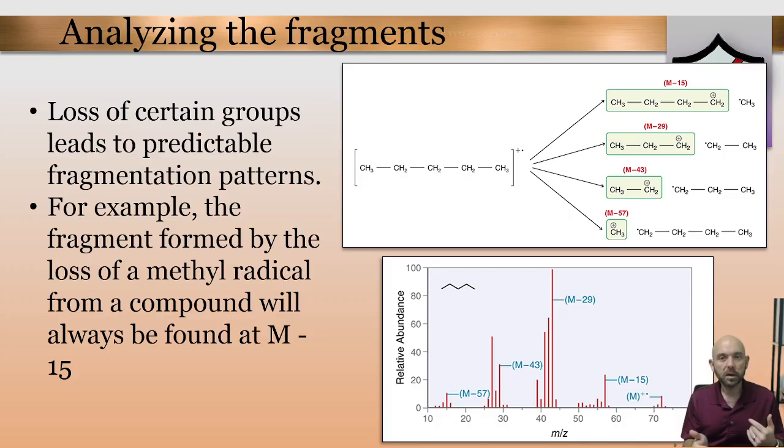So we can gain some information there with some analysis we can do on the so-called fragment peaks that we see down further closer to the front of the spectrum. And we see predictable patterns of these peaks across the mass spectra of different molecules. These fragments come from the fact that once these bonds have been compromised by having an electron knocked out of them, many times the molecule goes ahead and falls apart.